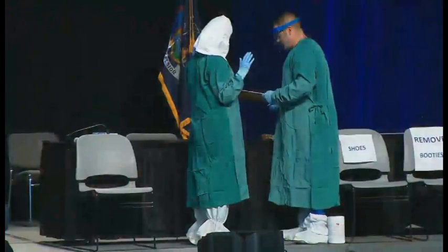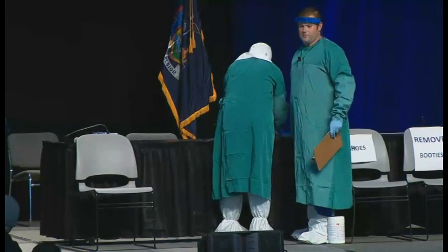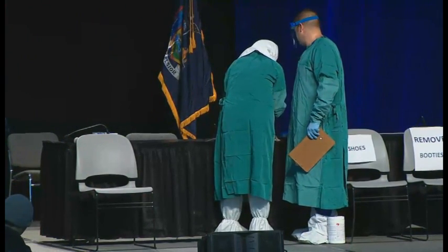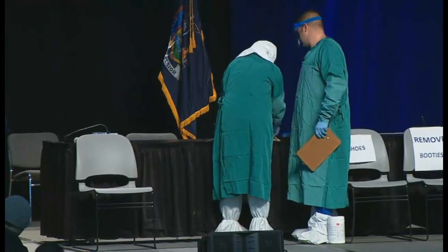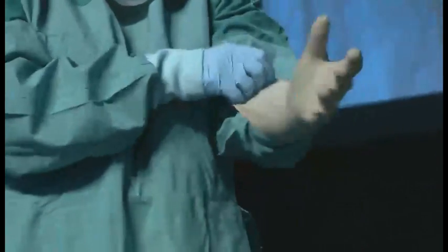Next, she's going to put on the second pair of gloves and make sure the cuffs are pulled over the sleeves of the gown. Two pairs of gloves — we do this to provide that added margin of safety so that there's an outer pair and an inner pair of gloves, which we think reduces the risk of contamination and provides the largest margin of safety possible.